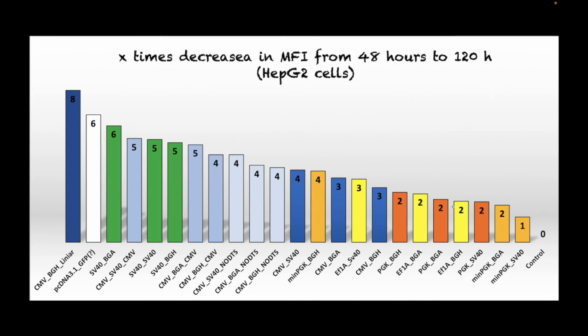But at least right now, I know that in HepG2 cells and using these SMAR vectors that I'm transfecting, EF1A promoter and BGH terminator provide by far the best expression overall. So not just at one time point, but at different time points in the whole gene expression process.